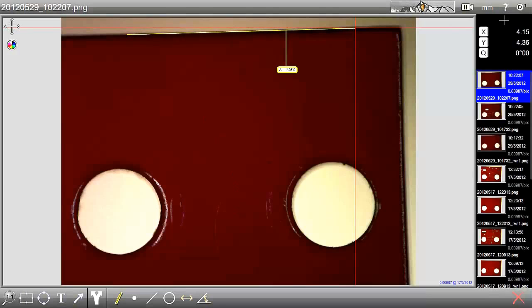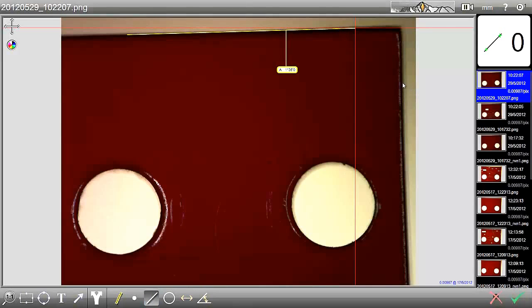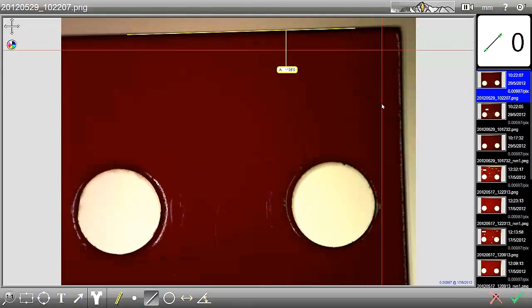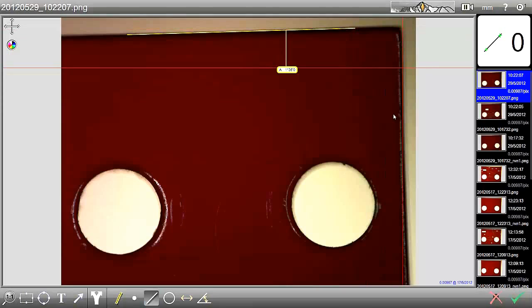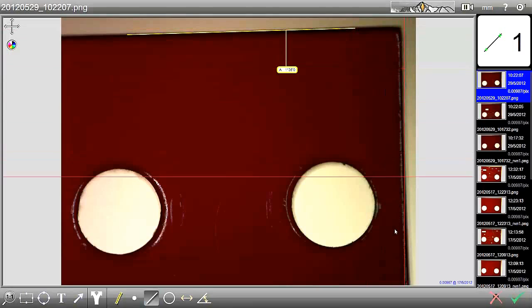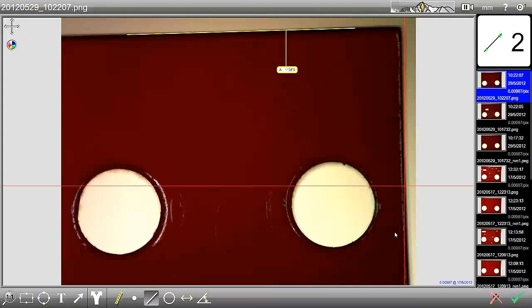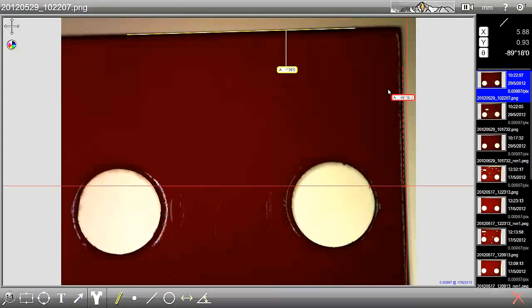We will now measure a second line, the one on the right. Again, I select the line from the icon at the bottom and this time just take a couple of points. Select that line and change the color if required.